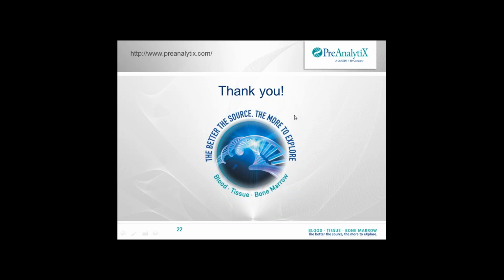Yeah, so this is a good question. So the manual kit, the QIAGEN kit, is based on chaotropic salt and alcohol chemistry. So silica material and binding via alcohol and chaotropic salts. And the QIAsymphony application is completely different. It's an anion exchange matrix, and therefore you have no alcohols and no chaotropic salts in it. The binding chemistry and the binding matrix are completely different systems.